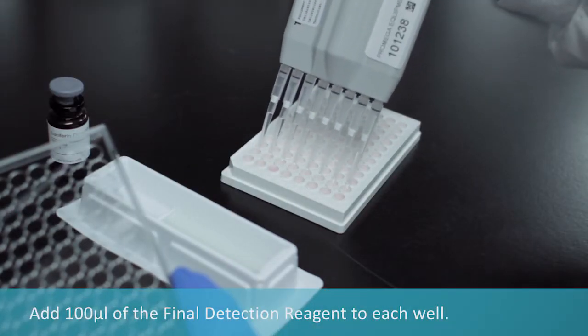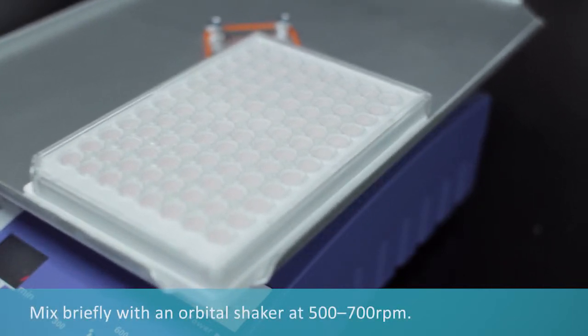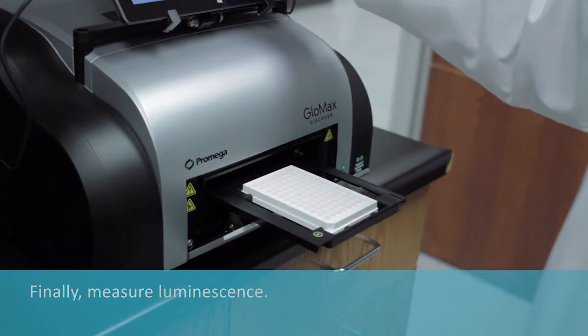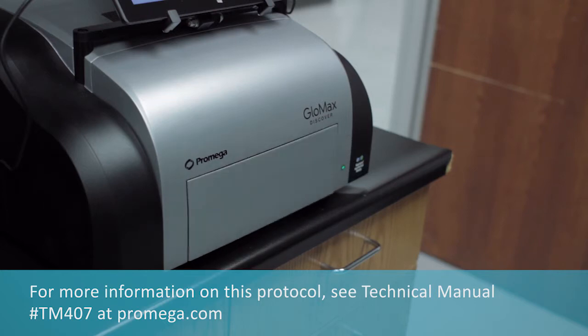Add final detection reagent to each well. Mix briefly with an orbital shaker at 500 to 700 RPM. Finally, measure luminescence. For more information on this protocol, see Technical Manual TM407 at promega.com.